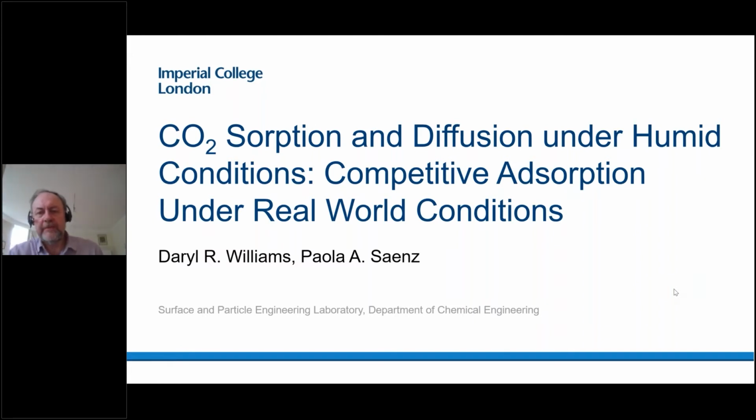Today's presentation won't be a long one, probably about 30 minutes, and I'm going to talk about carbon dioxide absorption as well as diffusion under humid operating conditions. And really we'll be talking predominantly around competitive adsorption processes under what I would describe as real-world process type conditions. And this is the work done by Paolo, one of my PhD students at Imperial College, who's working on this area of CO2 capture and diffusion.